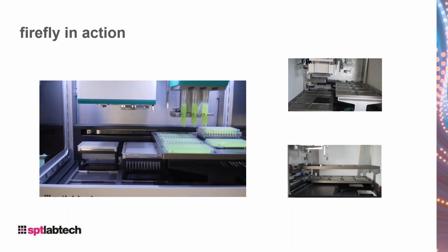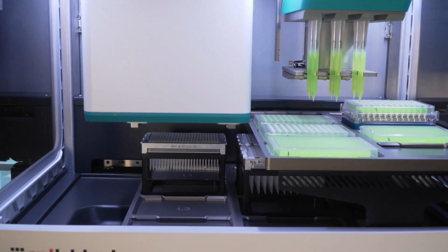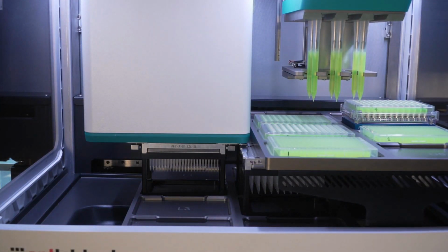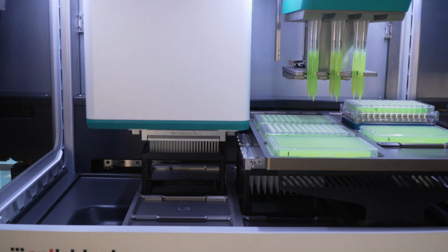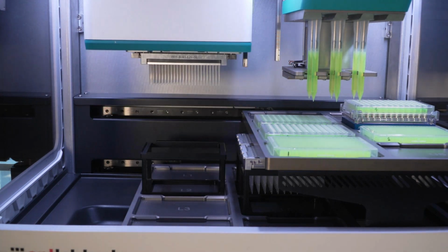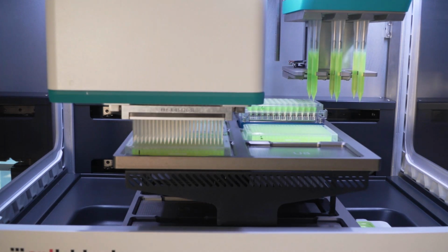And then finally, I'll just leave you with a quick video just to give you a sense of the Firefly in action. So let me just start this. So here it's just picking up a 384 head, and so it's picking up the disposable tips onto the 384 head. You can see that's coming from the lower deck, from the stand that the tips are placed on. The deck at the top now moves across, so we can go and aspirate samples from the 384 well plate.